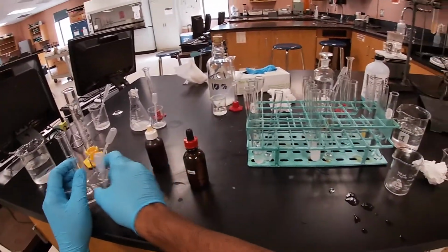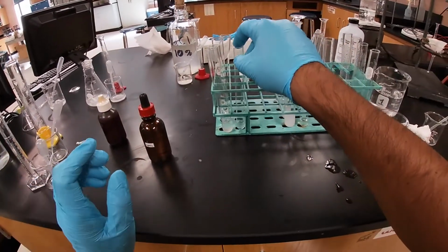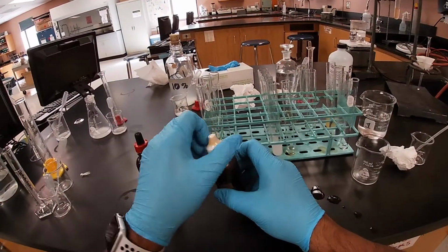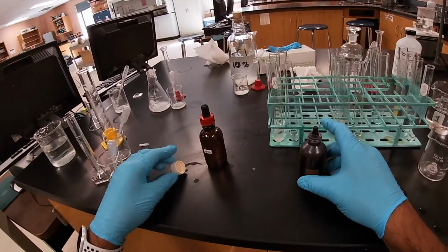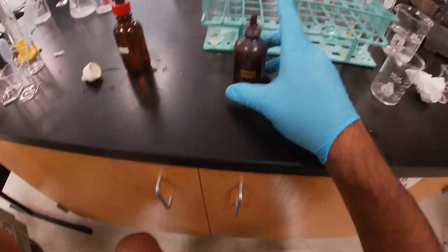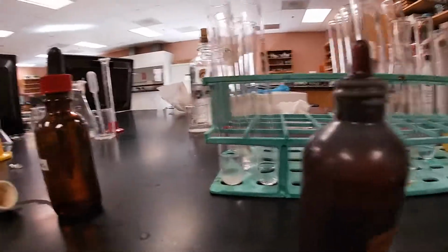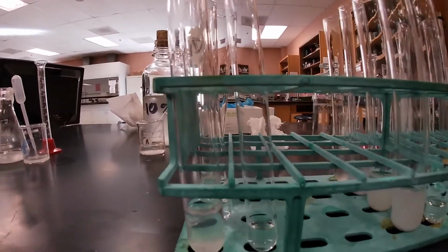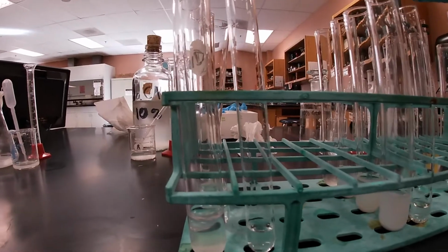So now that I measured out all our contents, we're gonna go through and determine our 3 tests again. Our first one's gonna be the iodine test. So let me go ahead and get you closer. As we get closer, we're gonna add some droplets.